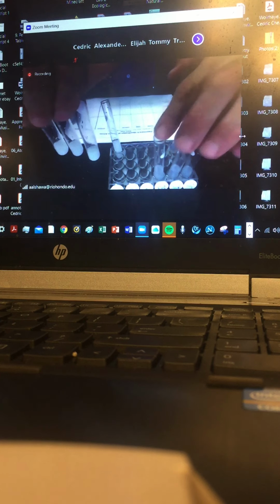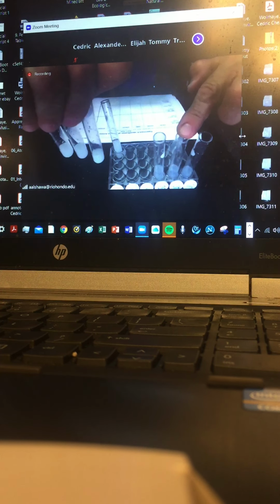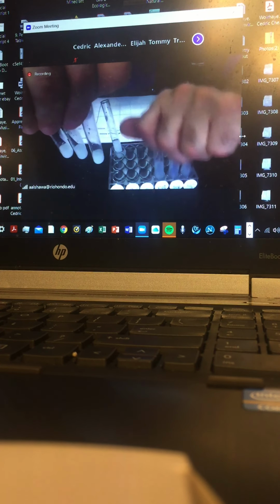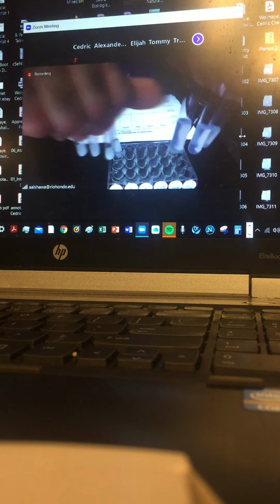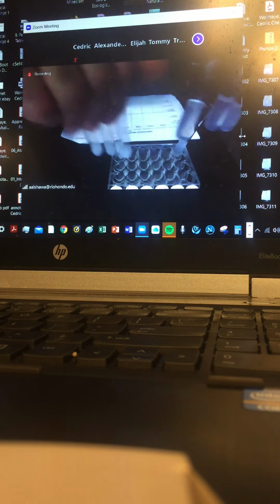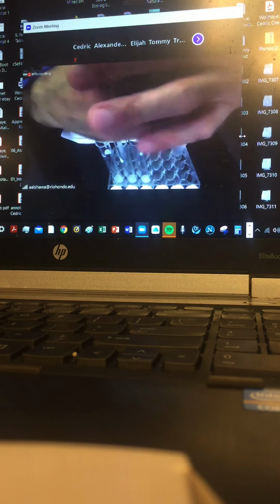So if you notice, the carbonate doesn't look the same as the sulfate. The first addition, when I added silver nitrate and showed you the color and the outcome, they don't have the same exact outcome. Now they all have pretty much the same outcome.